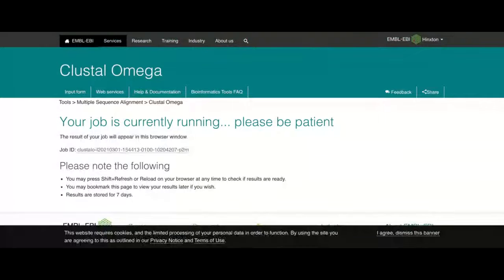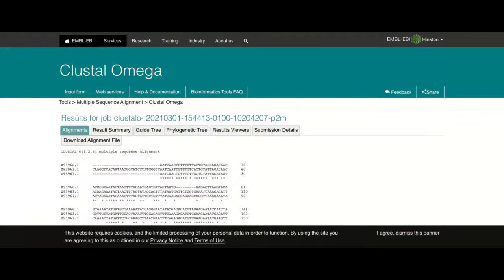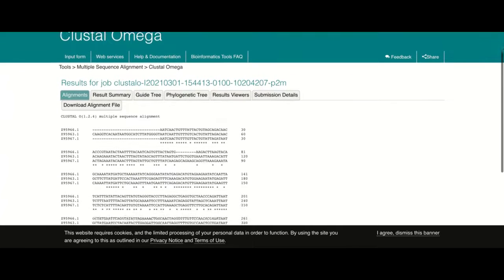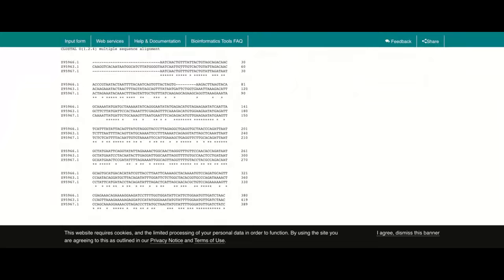It's not doing dynamic programming. It's doing some modification of it. As you guys know, it's comparing each 2, figuring out which 2 are most closely related. And then here they are. And as I said, fewer stars because now we are having 3 things agreeing. And I said, what's the 11 nucleotide stretch?